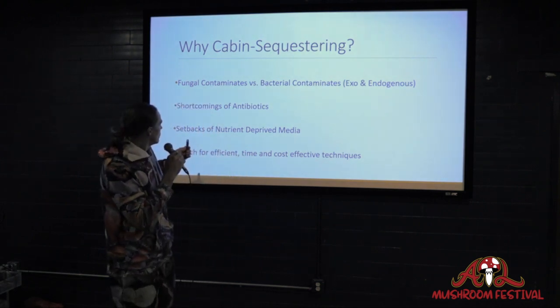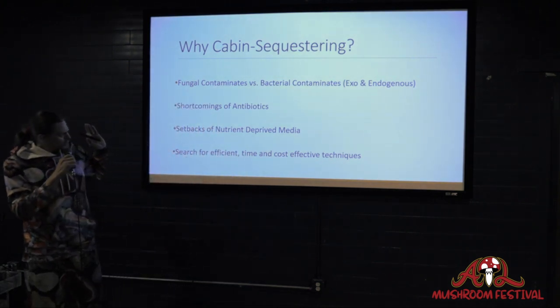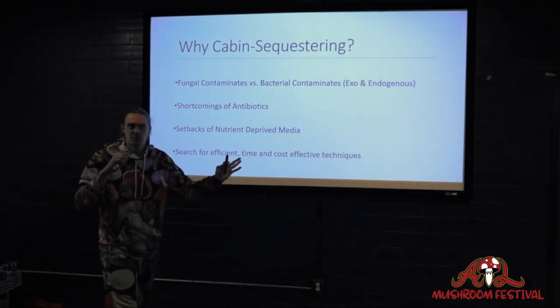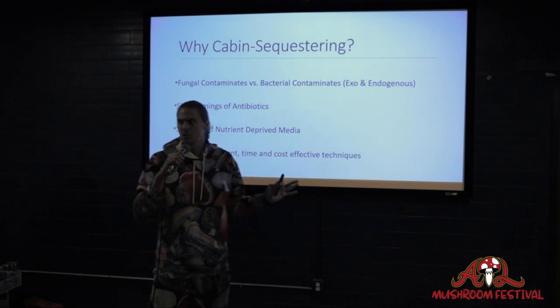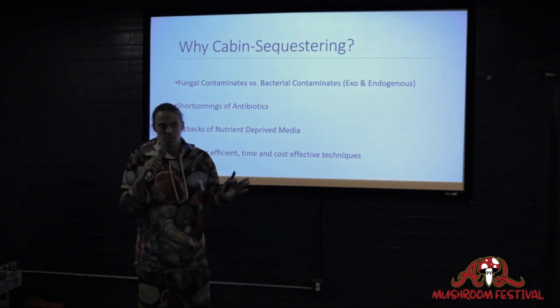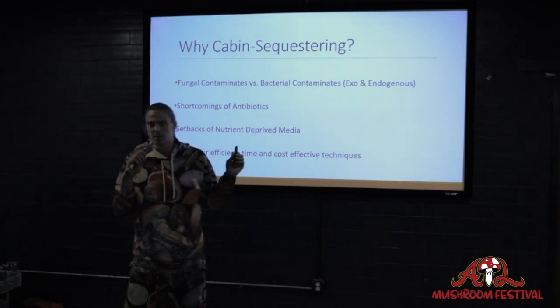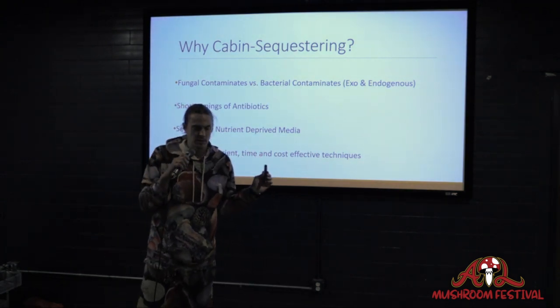And so this is about trying to overcome all the shortcomings of antibiotics, because antibiotics, for the most part, when you put them in agar, don't really work. It works a little bit, but as you'll see later in this presentation, it is not 100% effective. It's not even barely 50% effective.